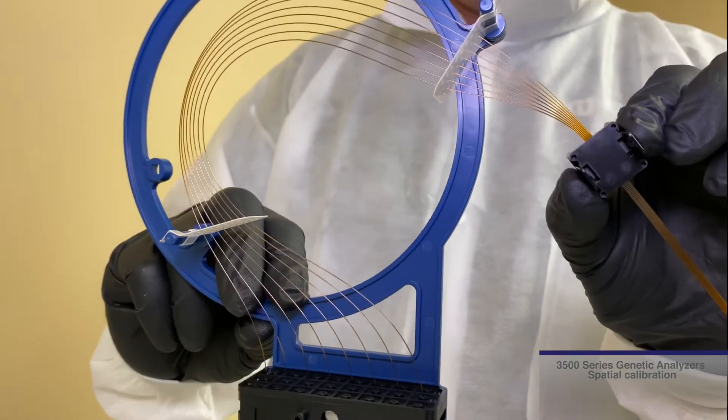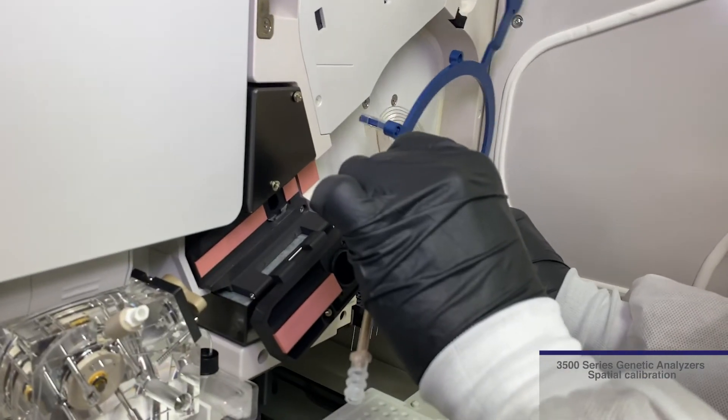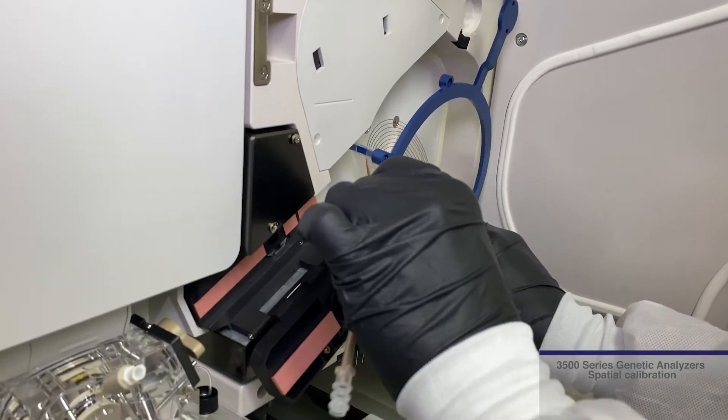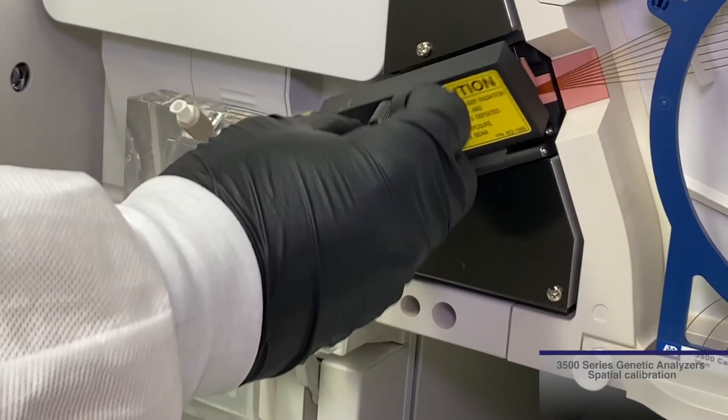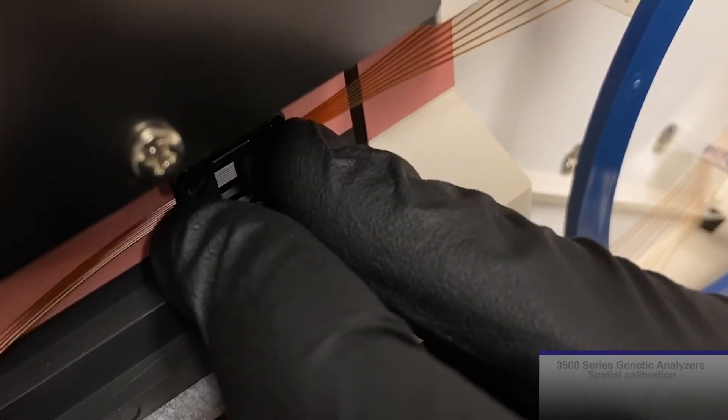A spatial calibration must be performed any time a capillary array is installed, the detector door is open, or the detection cell is moved.